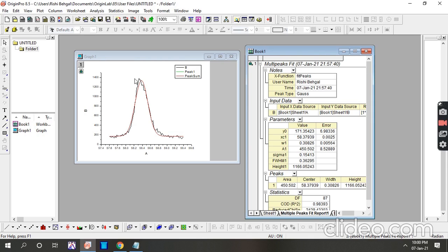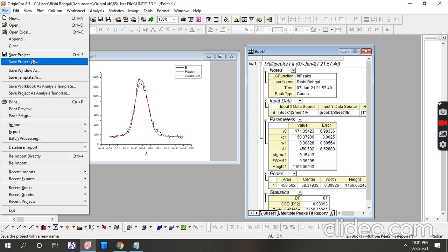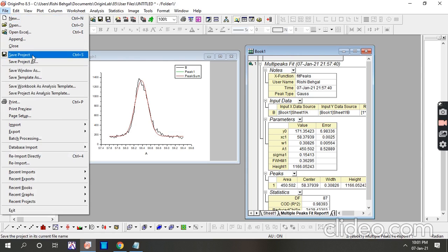I just show you how to save data in Origin. This is a new file, you can simply press Ctrl+S to save and save the project.